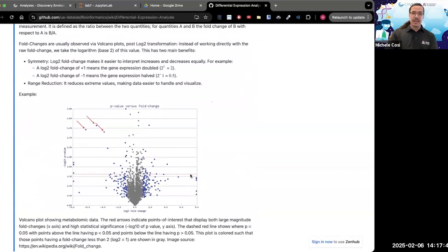So what you're looking at is the threshold being here. You want to observe the ones that are both further away from the center and further away from the threshold. So yes, these ones right here. No problem, thank you for asking. I'm also trying to catch myself saying something wrong here, so thank you for asking the questions.